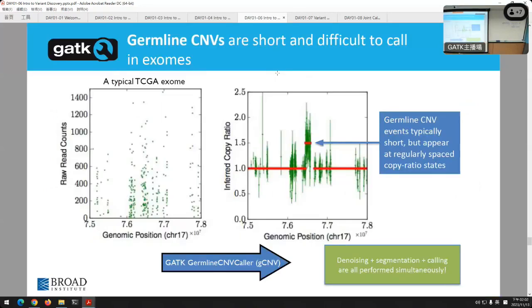Structural variation is super complicated. So I think GCNV, the germline CNVs, will happen on Wednesday afternoon. It is, again, very similar to the somatic use case, trying to figure out where these copy numbers are. Most of the mutations in cancer are very big. Whole arms of chromosomes are missing. We have a cool picture coming up, I'll show you on Wednesday, of a somatic breast cancer cell or a colorectal cancer cell. And cancer does terrible things to your genome.